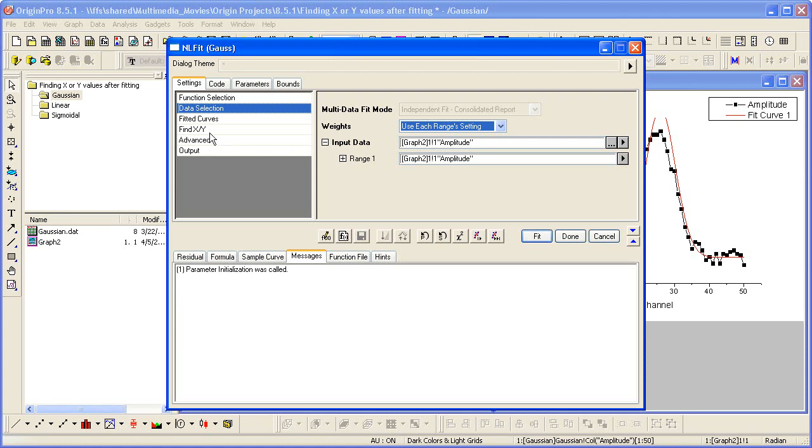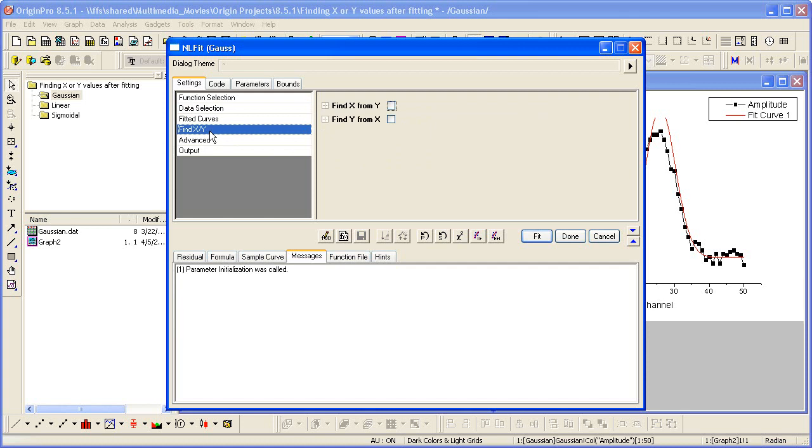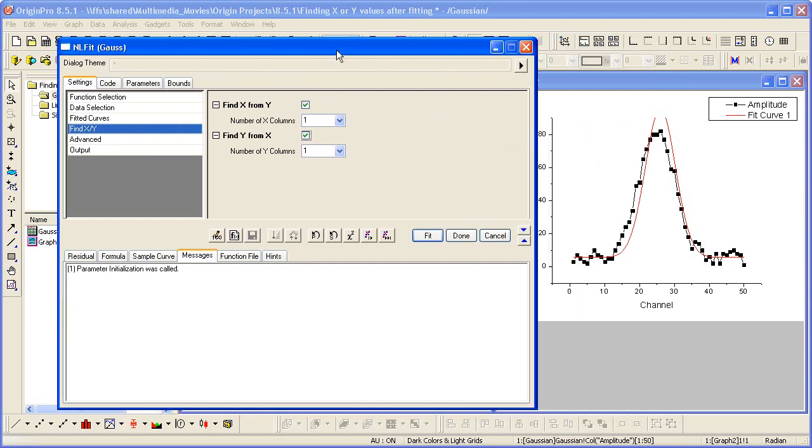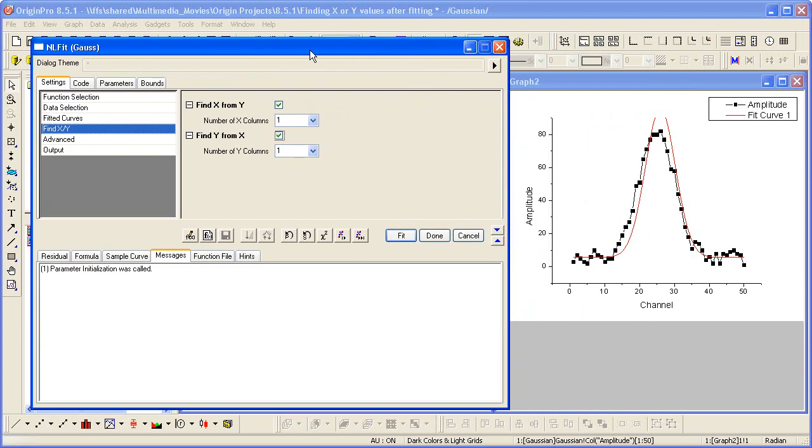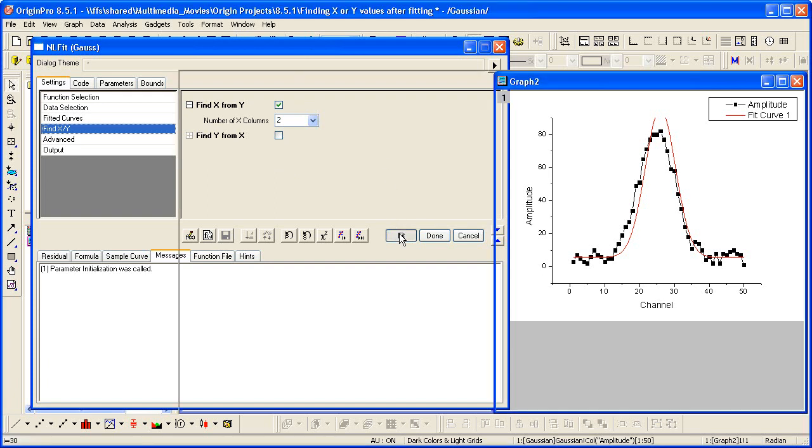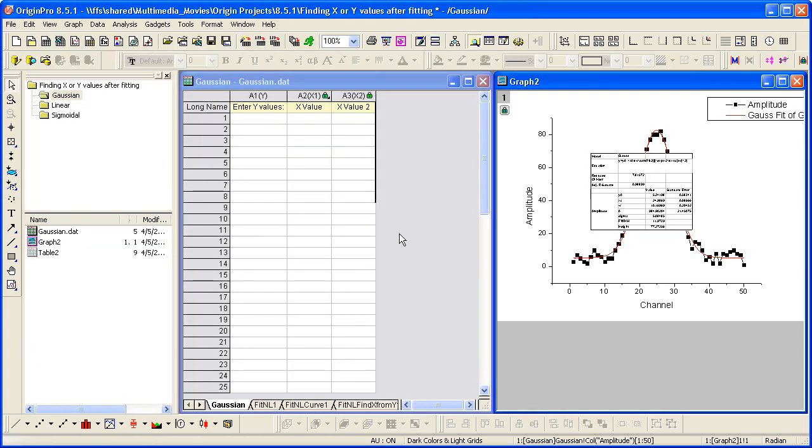If I want to use this fit curve as a standard curve to calculate unknown values, then again I simply turn on this feature here. Now in this case, for finding X from a given Y, there's going to be two results. So I need to say two columns. And let's go ahead and just calculate Find X from Y. So I click on Fit.